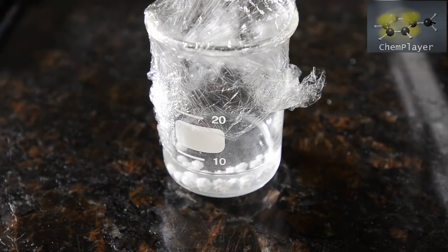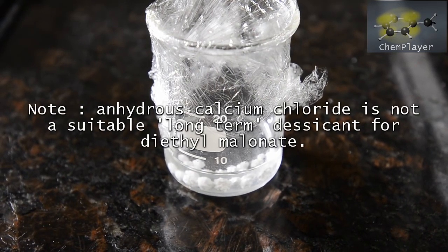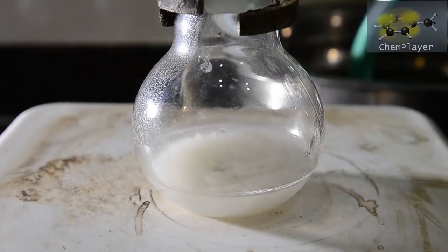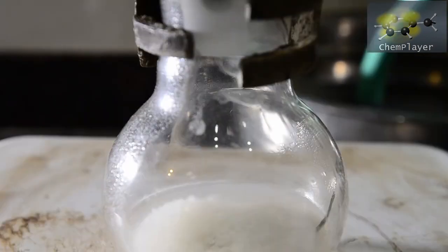And here's our diethylmalonate from the distillation we did. We've placed it into a small beaker with a few granules of anhydrous calcium chloride to make extra sure it's properly dry. Our sodium has now completely reacted and we've got a slightly viscous cloudy sodium ethoxide solution now. So first we add the diethylmalonate to the reaction flask.